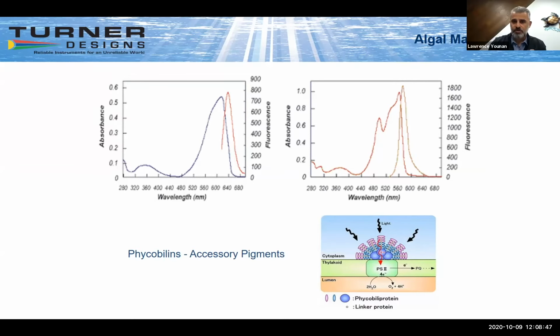And you see where the spectra overlap, where I've circled them in black there. That's a difficult thing to deal with when you're looking at optical instrumentation to pick out that fluorescence signal. Nowadays, we can pinpoint any part of that spectra, the front end or the tail end of that curve that you see on the screen there, and then develop a fluorometer using, of course, advanced electronics, to increase the sensitivity of the fluorescence from that pigment and detect it better.